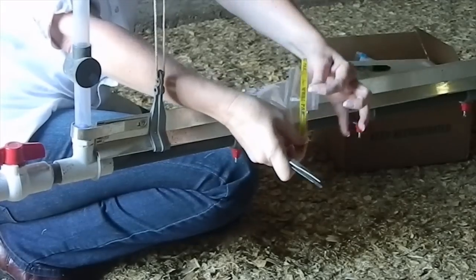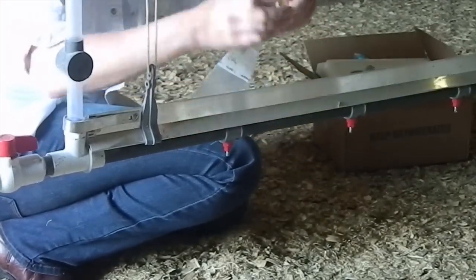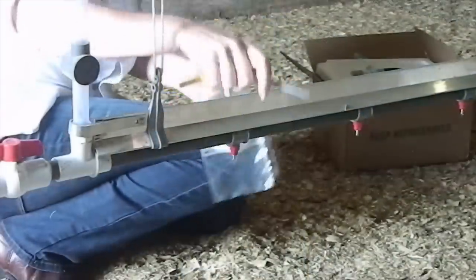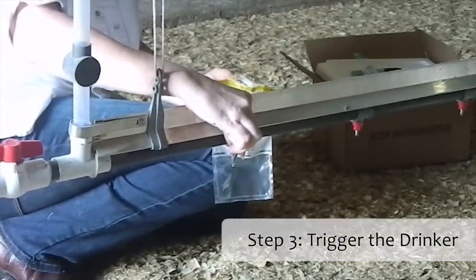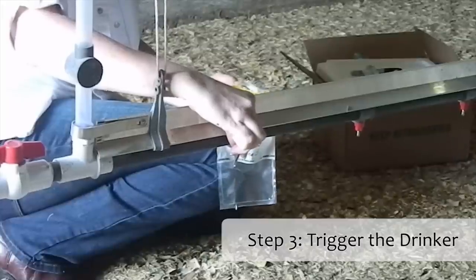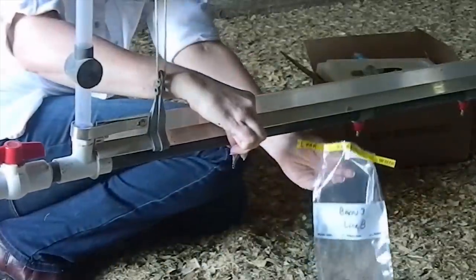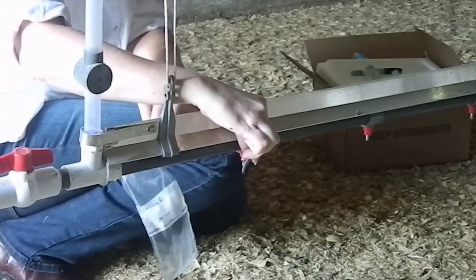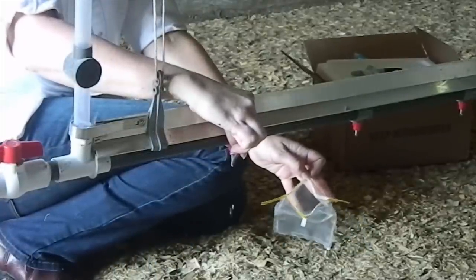Go ahead and take off the top of your foil pack bag — they're sterile. What you'll need to do is trigger the drinker. Just push up on it so that it runs for 15 to 30 seconds. That way you've got water movement from whatever may have settled in the bottom of the drinker. Make sure your bag doesn't touch anything else.